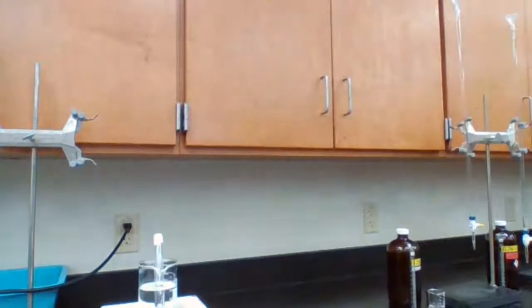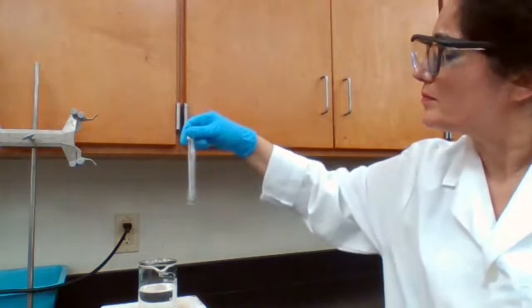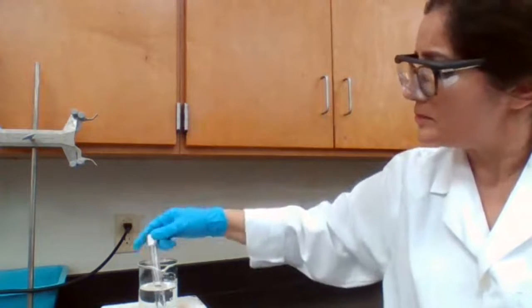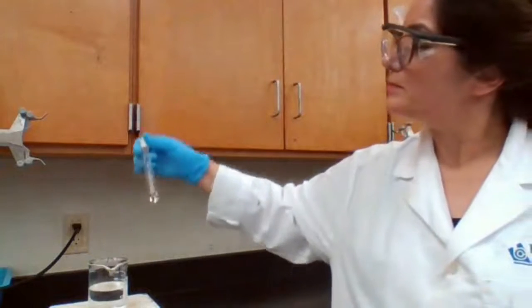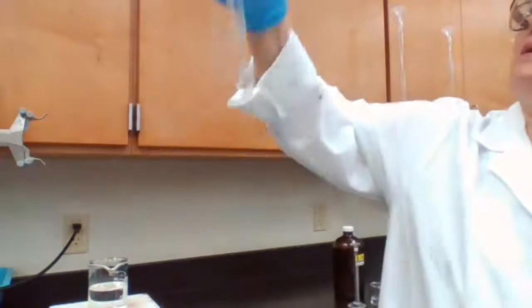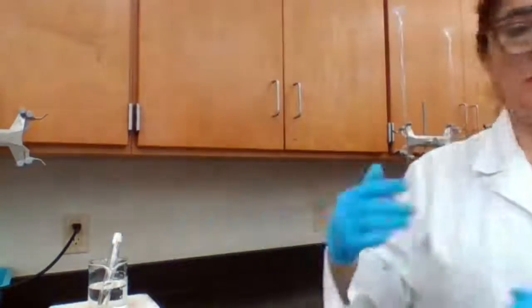It says it's saturated, so. It turned a little cloudy, but no obvious change. So I wouldn't stop here. I'm going to continue heating, see what is actually happening.